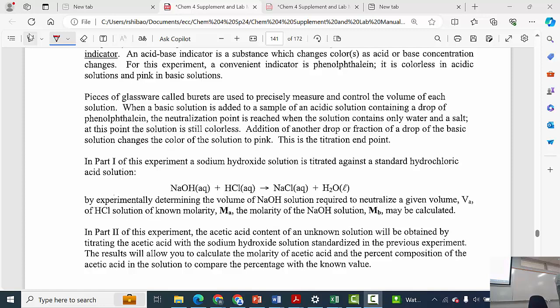Basically, they break up the cell membranes, apparently, and that's why it's so slippery, because your cells are being broken apart. But if your fingers feel slippery, don't rub your eyes, because that's how people get sodium hydroxide in their eyes. That's one way. The other way is it splashes into their eyes.